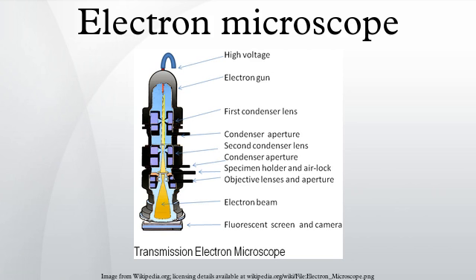Cryofixation: freezing a specimen so rapidly, in liquid ethane, and maintained at liquid nitrogen or even liquid helium temperatures, so that the water forms vitreous ice. This preserves the specimen in a snapshot of its solution state. An entire field called cryo-electron microscopy has branched from this technique. With the development of cryo-electron microscopy of vitreous sections, it is now possible to observe samples from virtually any biological specimen close to its native state.